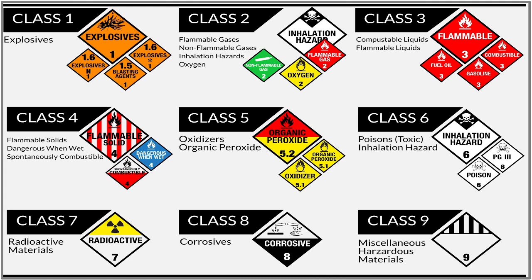Class 4 are flammable solids, dangerous when wet, spontaneously combustible. You can see the different pictograms. Please pause the video to have a good look. Class 5 are organic peroxides, oxidizers. Class 6 are poisons, inhalation hazard.